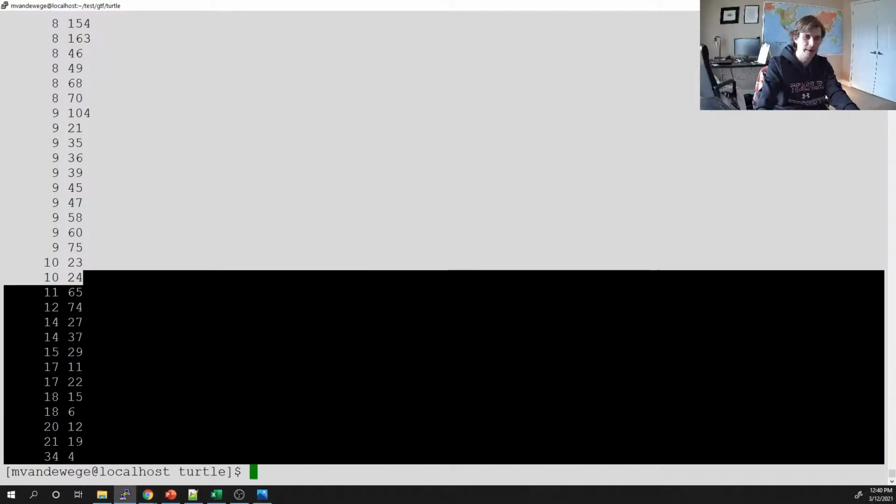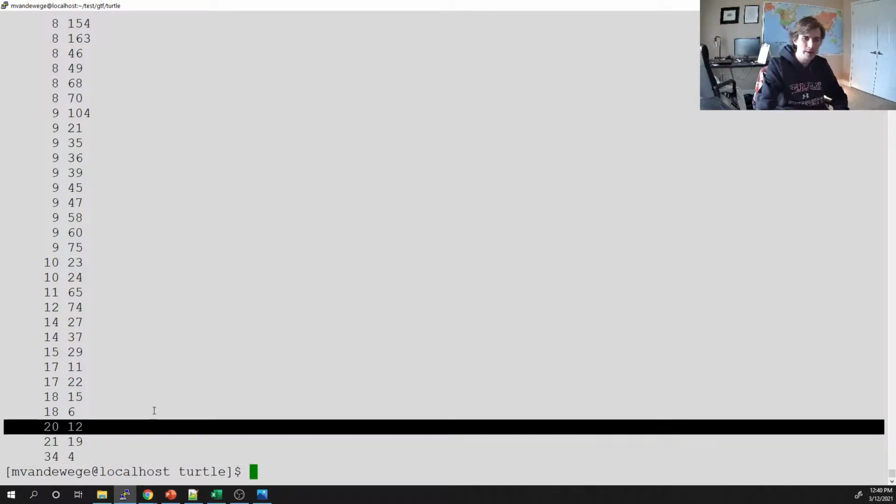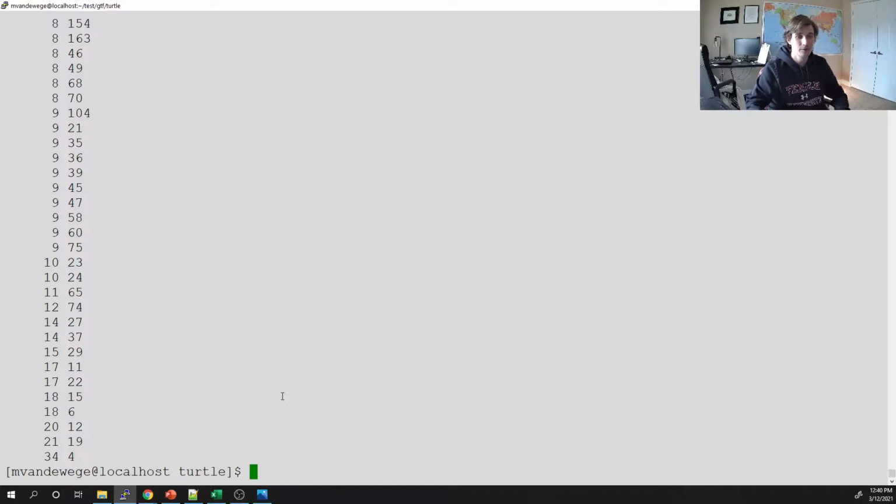And so now everything's sorted out, and we can see that the biggest cluster has 34 genes in it, and it's at that 4th cluster that we've seen before. The next biggest is 21, 20. But again, I promise, this does not necessarily reflect reality, it just reflects the genome draft. Most likely these clusters are, you know, hundreds of genes large. And a lot of these clusters that seem independent, they probably overlap with each other. They probably do form a contiguous single cluster. It's kind of neat stuff.